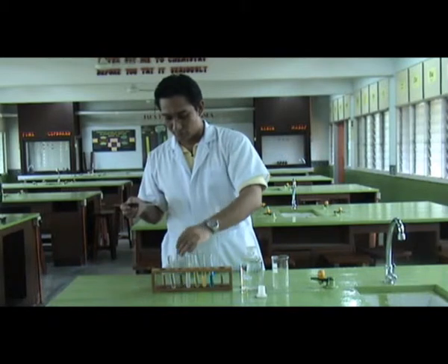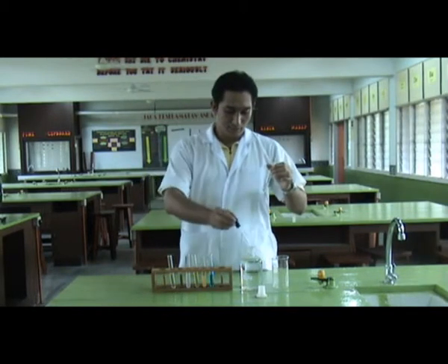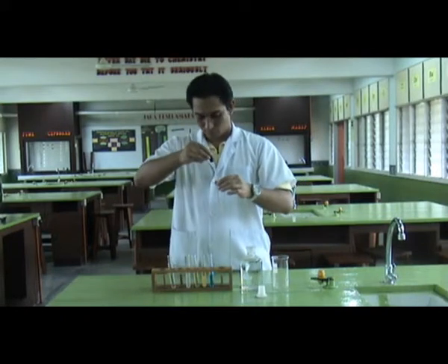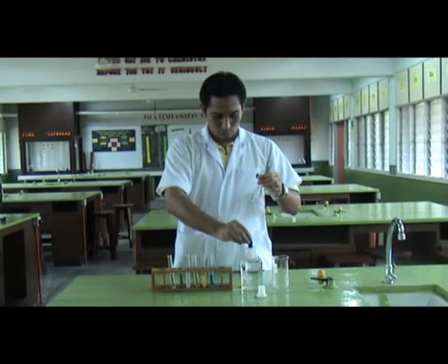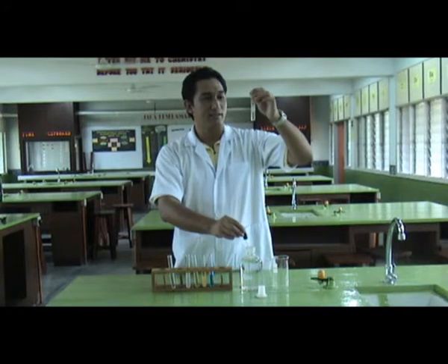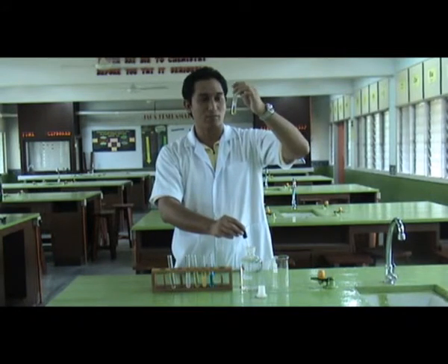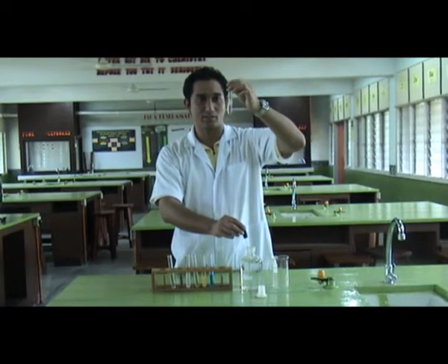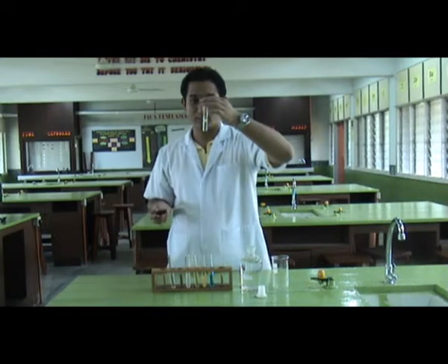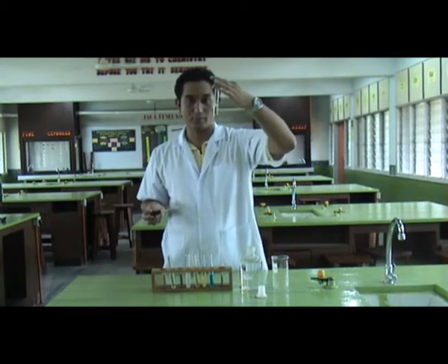Next is zinc. I found out that zinc had a white precipitate substance formed in the top layer of the test tube. You can see the white precipitate.